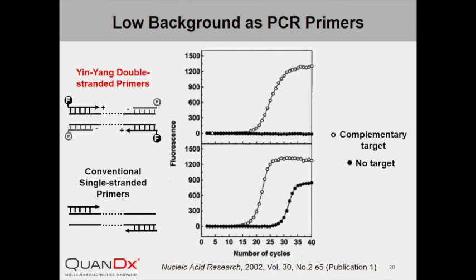As shown in a parallel comparison between InYang Primer and conventional single-stranded primer, significant background amplification was detected in the negative control with single-stranded primer, while no background fluorescence was detected with InYang Primer even after 40 cycles of amplification. The design of InYang Primer is also quite flexible — when primers of different lengths were tested, all gave typical real-time PCR amplification curves.